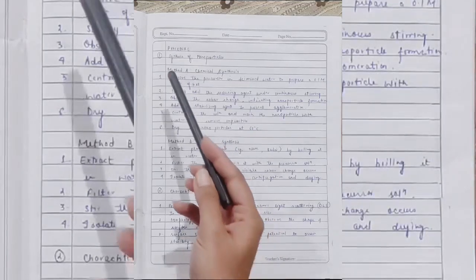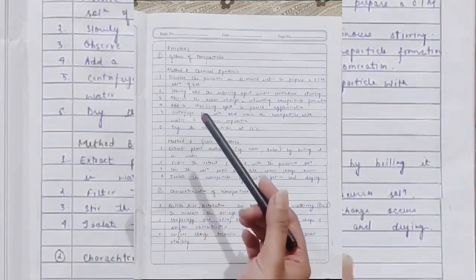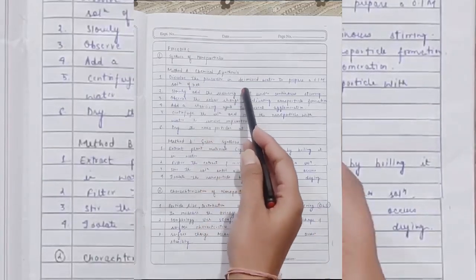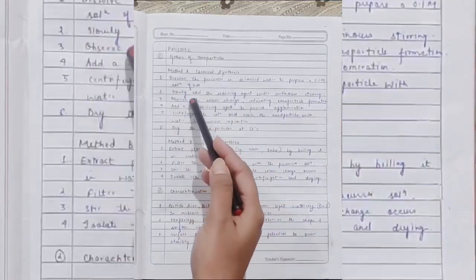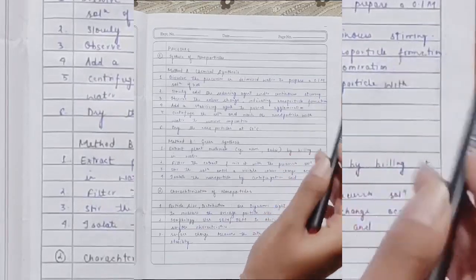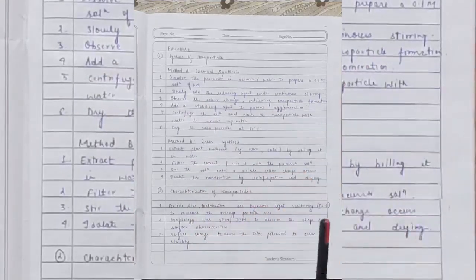Moving ahead to the procedure of the nanoparticle formulation, first of all, method A, we will be discussing the chemical synthesis. So, dissolve the precursor in deionized water to prepare a 0.1 molar solution of the KCl. Next, slowly add the reducing agent under continuous stirring. The stirring is very important. Observe the color change indicating nanoparticle formation.